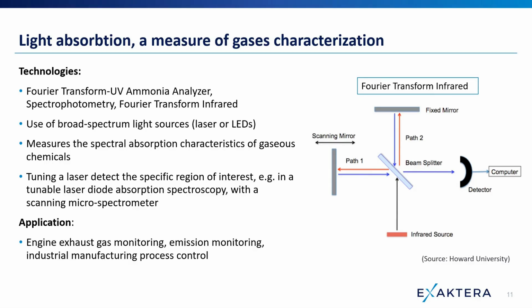A broad spectrum source allows for detection of a wider range of gases, whereas a narrow range, perhaps tunable laser source, can be used for closer examination of a critical region of the spectrum and more sensitive detection or more precise measurement of a specific gas.